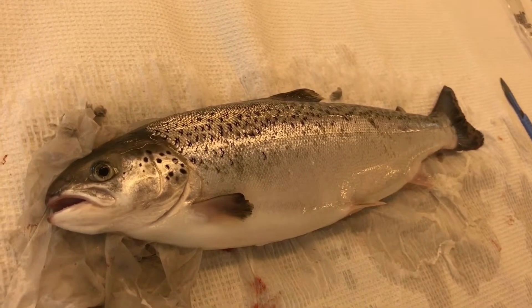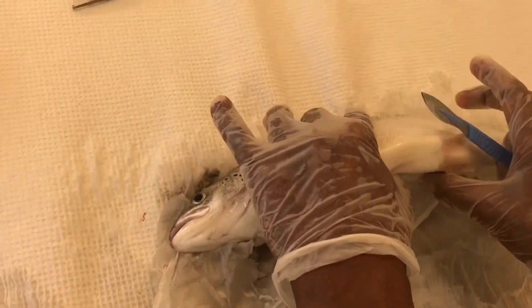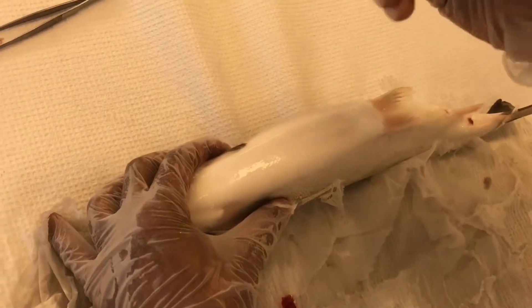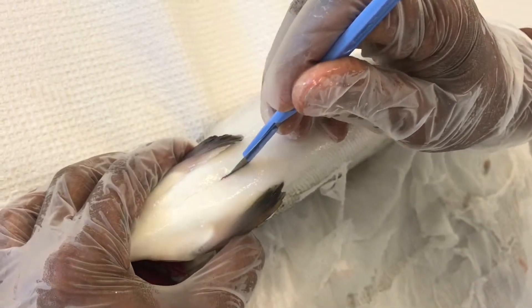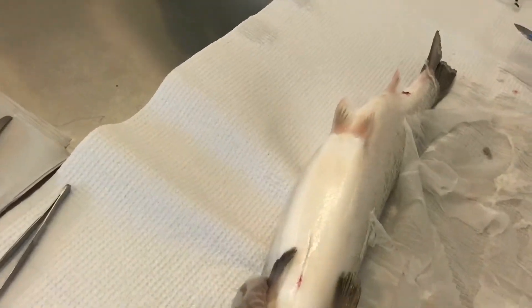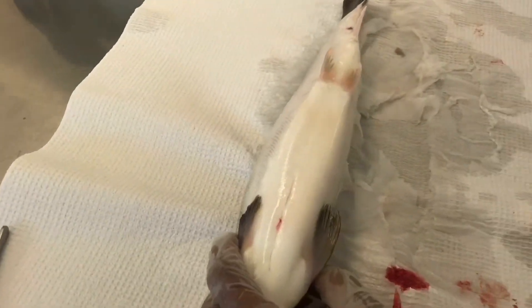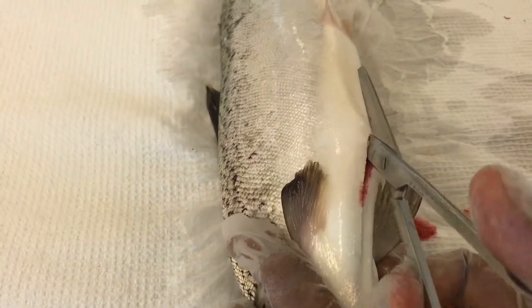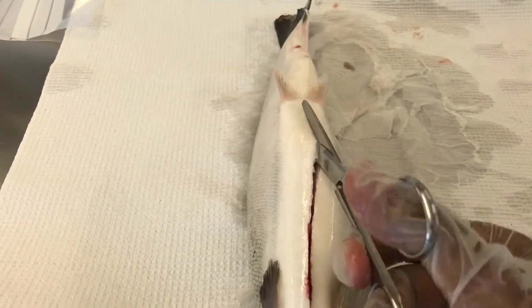There are a number of ways of opening a fish. Here we demonstrate one of these methods. Simply start by having an incision in the mandibular region ventrally on the midline, then use scissors and incise along the medial line towards the vent.